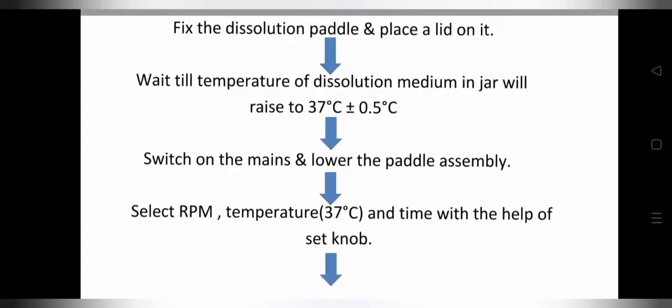Next step, fix the dissolution paddle and place a lid on it. Wait till the temperature of the dissolution medium in the jar rises to 37 degrees Celsius plus or minus 0.5 degrees Celsius. Next, switch on the mains and lower the paddle assembly. Select RPM, temperature 37 degrees Celsius, and time with the help of the set knob.